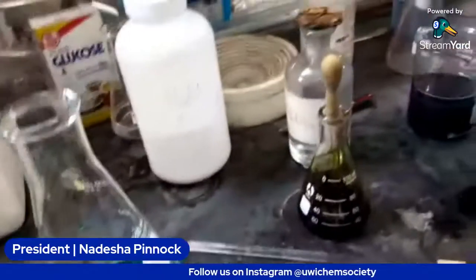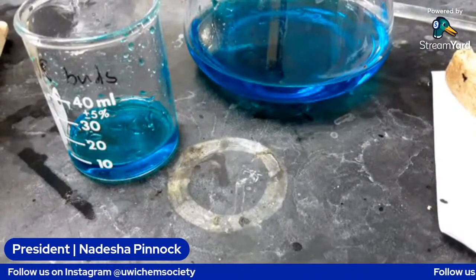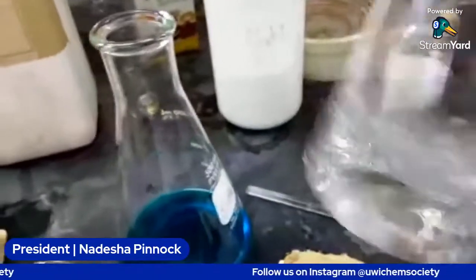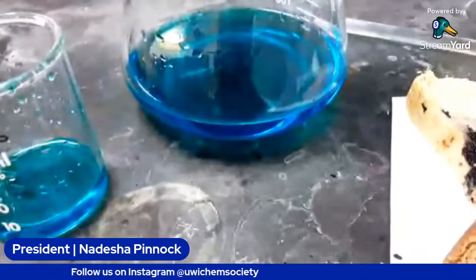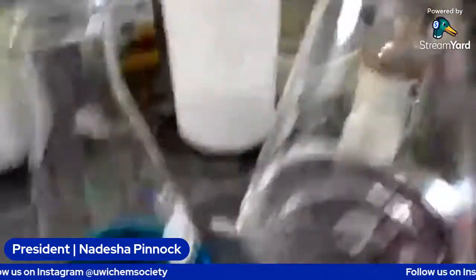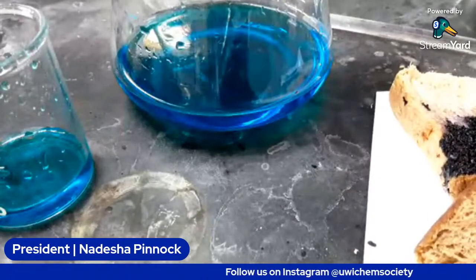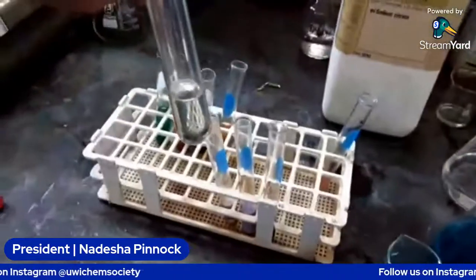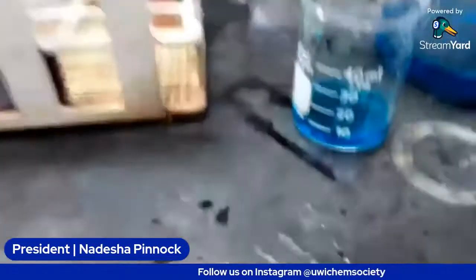All right, so the test that we have left is the lipid emulsion test using ethanol. So we have some ethanol here. We're supposed to use 95%. I think this is 100%. So I'm going to have to dilute it. Or we could try using the 100%. Why not? So this is the oil that we have to do our lipid emulsion.